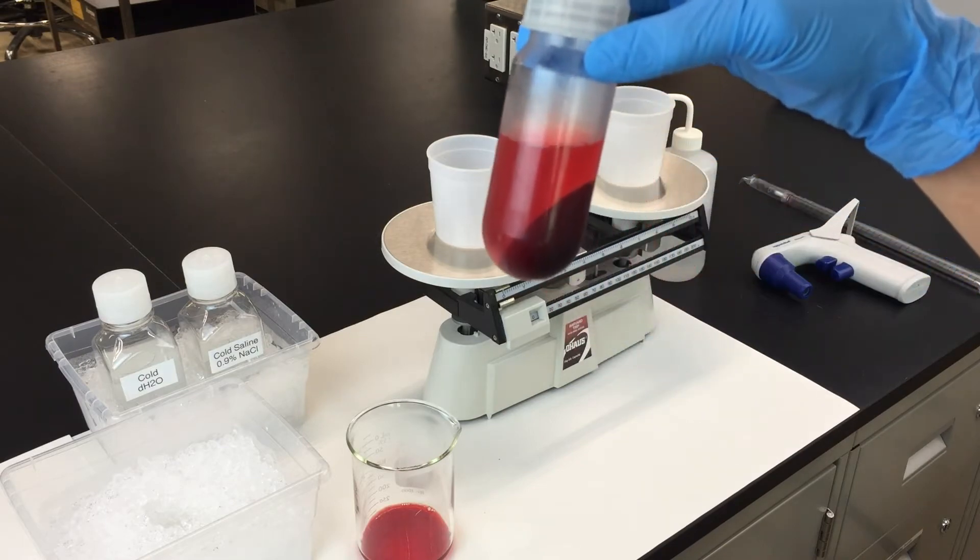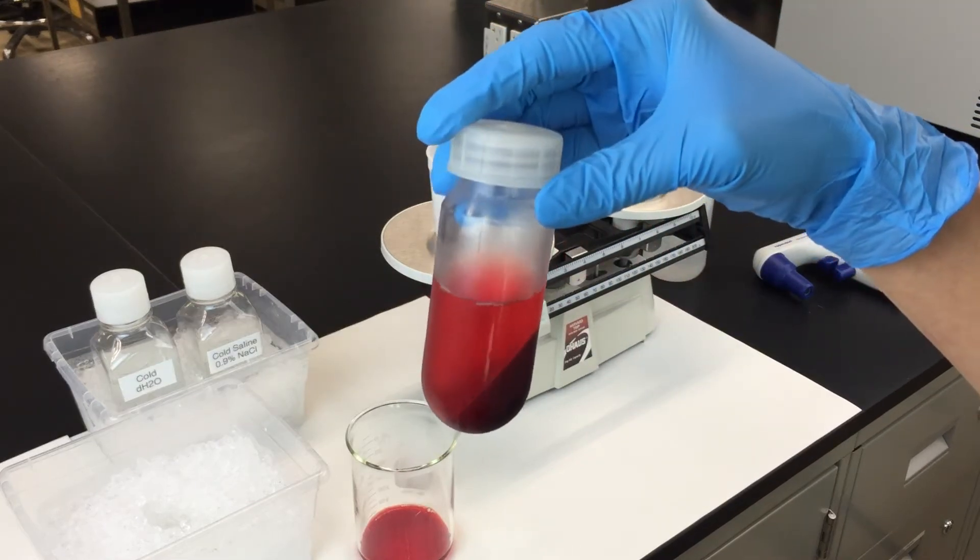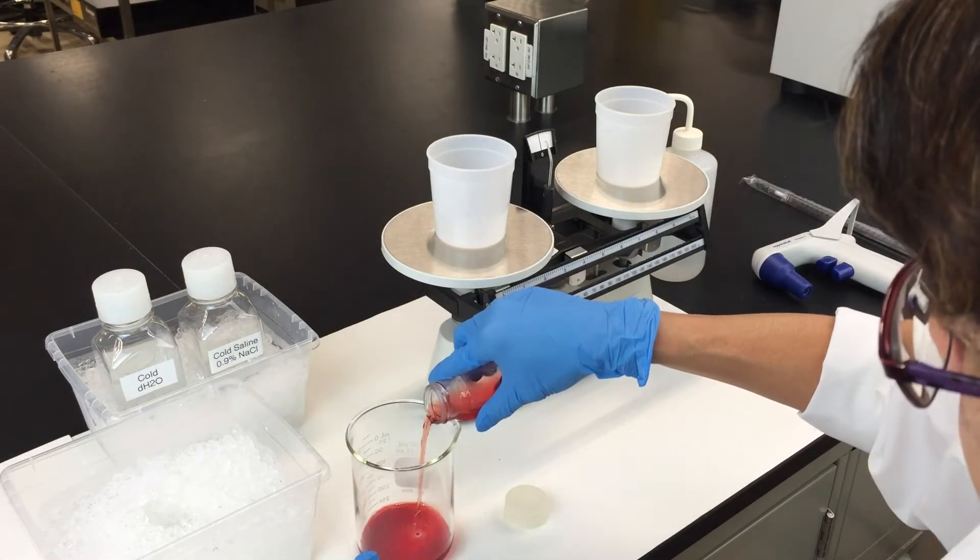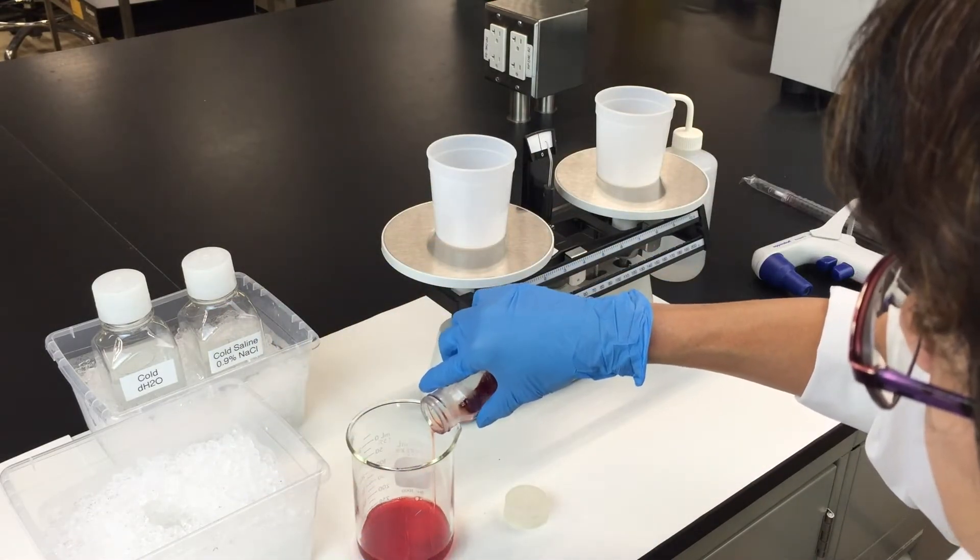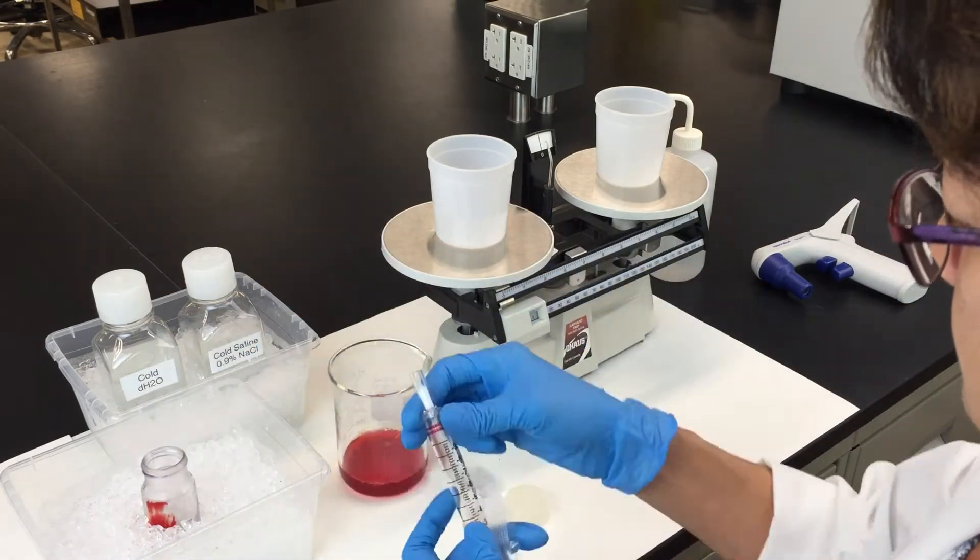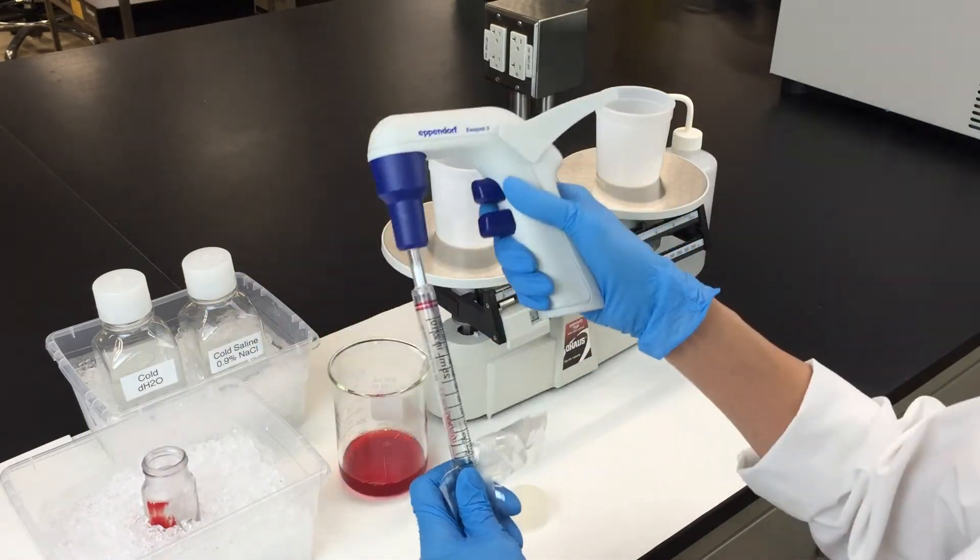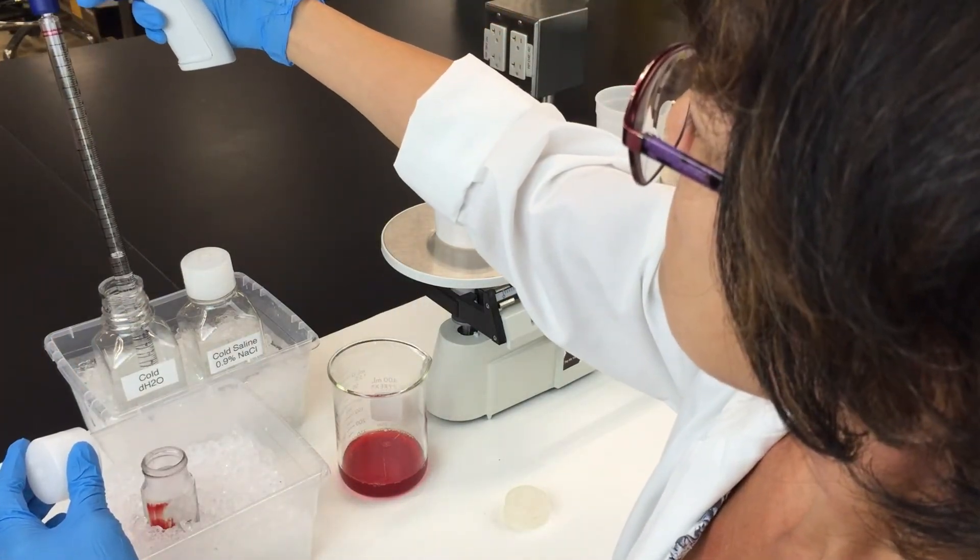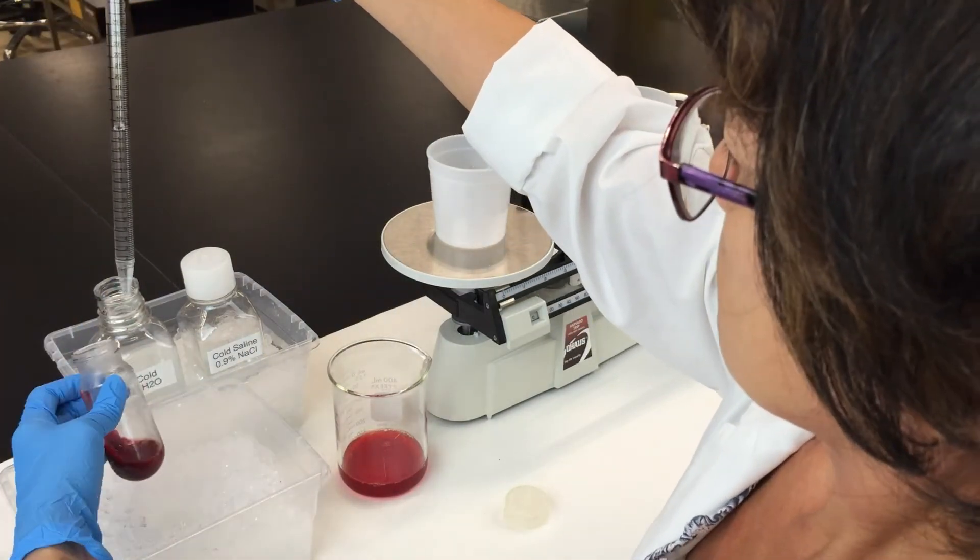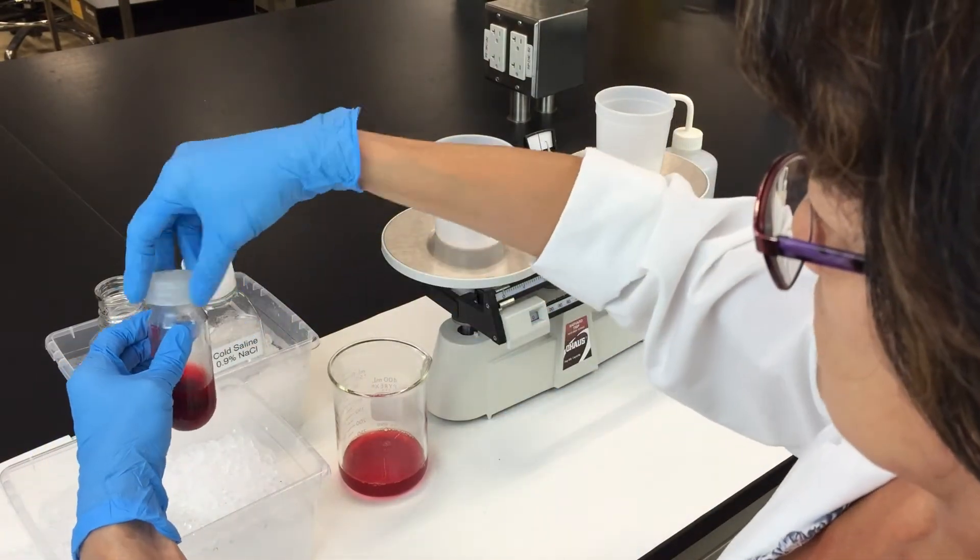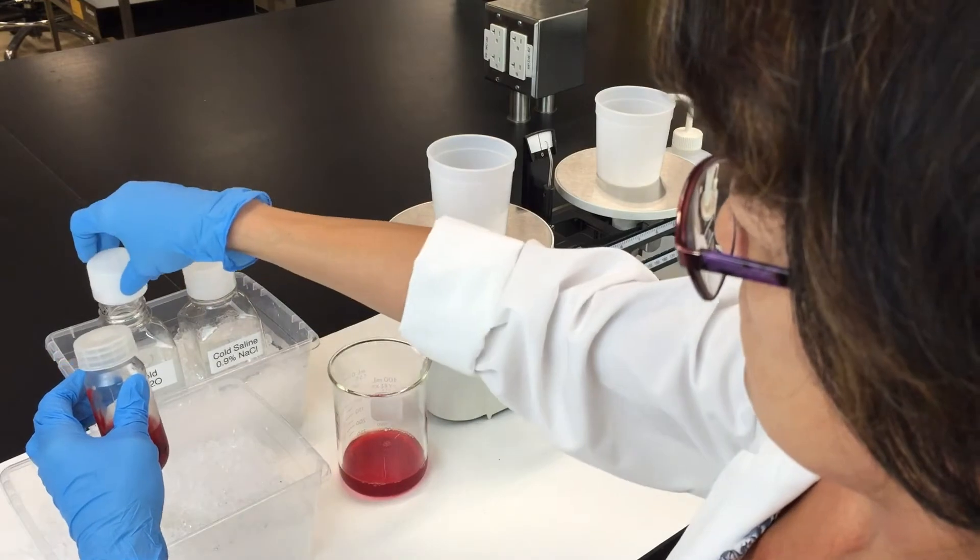After the second spin, the red blood cells will have formed a pellet in the bottom of the tube again. Pour off the liquid and keep the pellet. Now add 15 ml of cold distilled water to the tube. The distilled water will cause the red blood cells to burst, releasing the hemoglobin into solution.